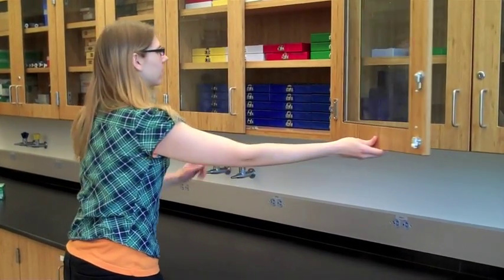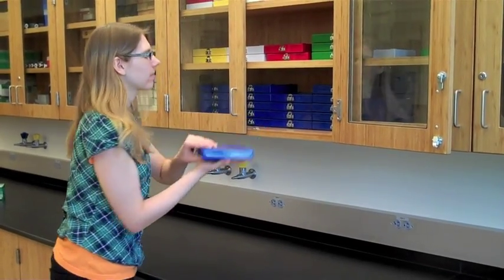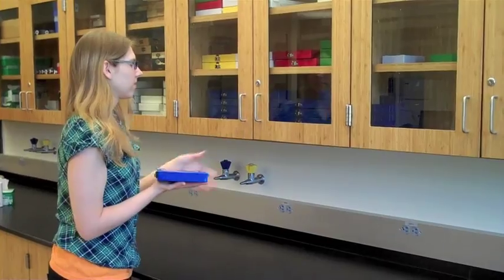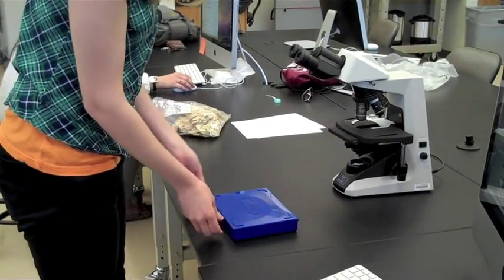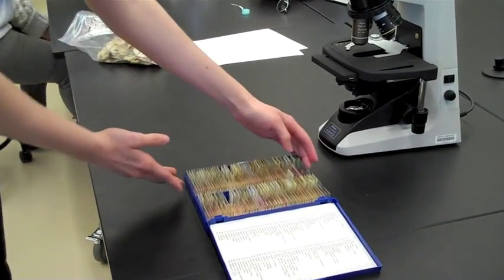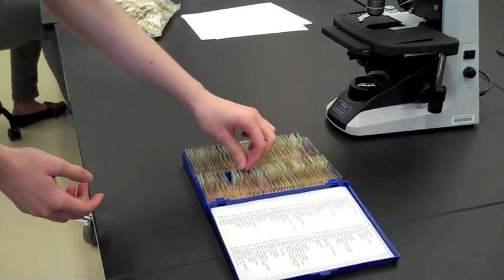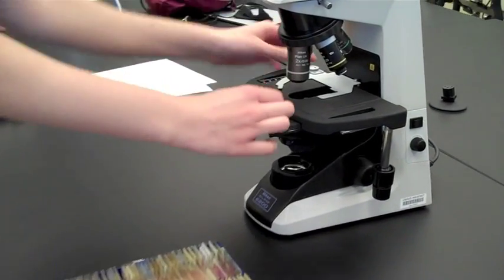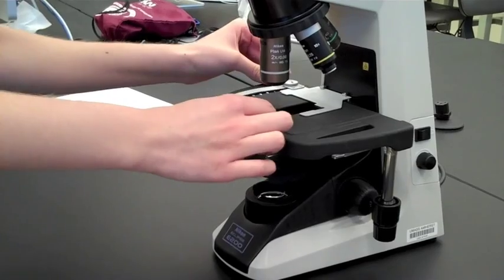Go obtain a slide box from the cabinet for viewing. Handle carefully because they are very expensive. Open the slide box. Find your desired slide and place it onto the microscope stage. Make sure the slide is face up on the stage.